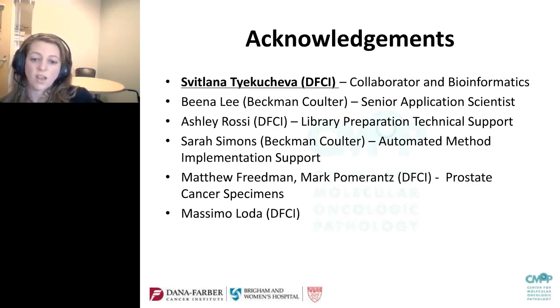I'm looking at a question from Magnolia Bostic, Clonetech Laboratories. Have you ever tried additional DNase treatment of the FFPE RNA prior to library prep? And do you know if the difference between your intron and exon is library prep and not sample? What are the other library prep methods you use?